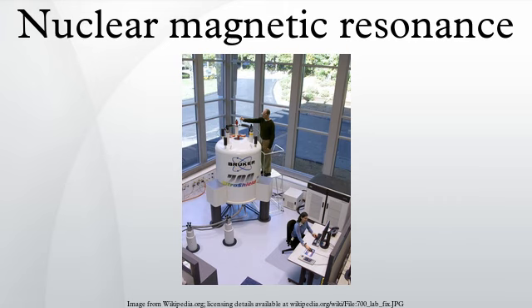Purity determination. NMR is primarily used for structural determination, however it can also be used for purity determination, providing that the structure and molecular weight of the compound is known. This technique requires the use of an internal standard of a known purity. Typically this standard will have a high molecular weight to facilitate accurate weighing, but relatively few protons so as to give a clear peak for later integration, for example 1,2,3,4-tetrachloro-5-nitrobenzene. Accurately weighed portions of both the standard and sample are combined and analyzed by NMR.